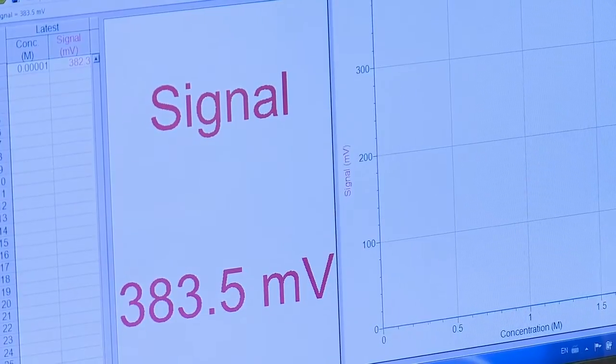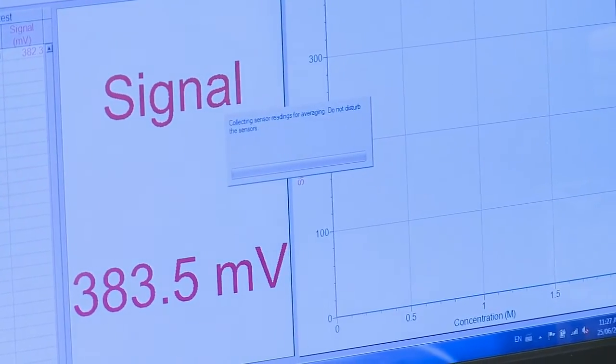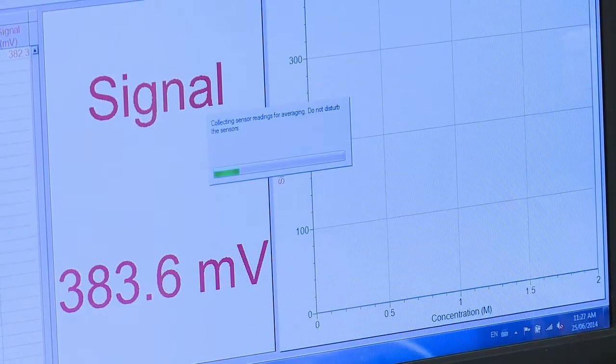Roughly every 15 or 20 seconds, you'll want to click Keep again until you have three replicate values for your measurement.